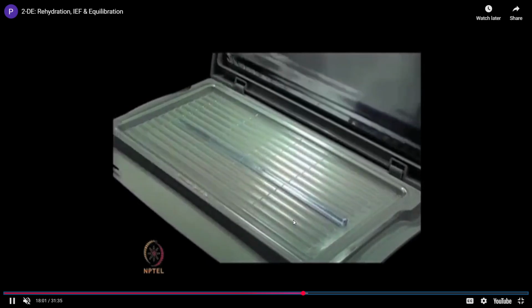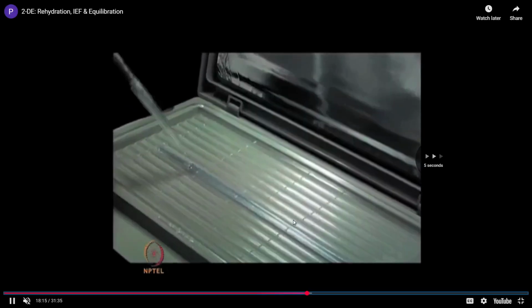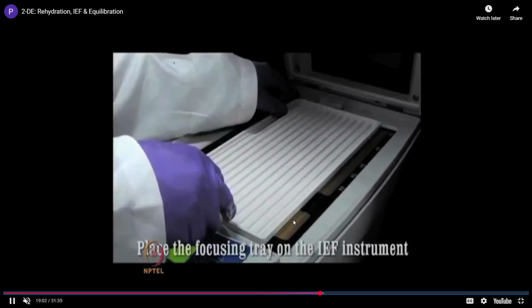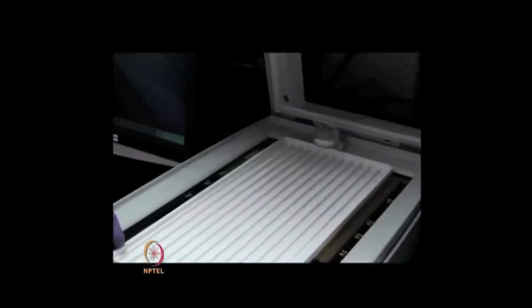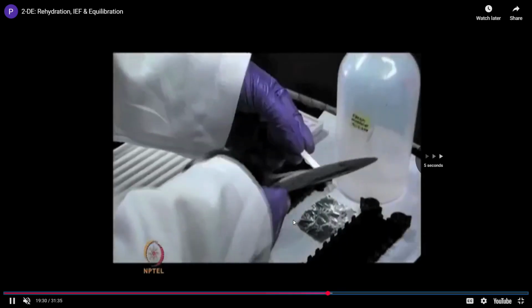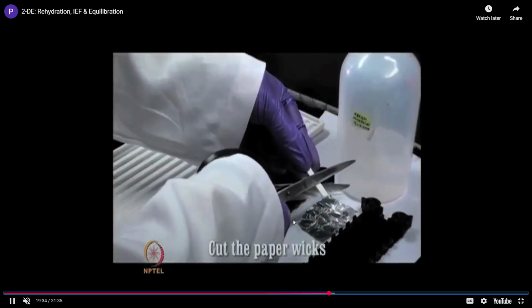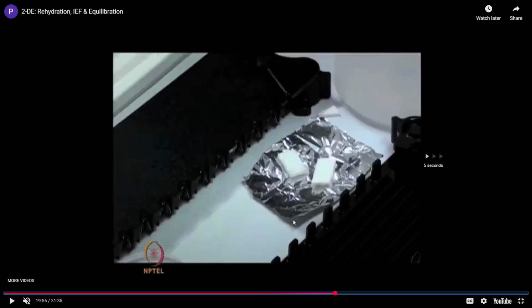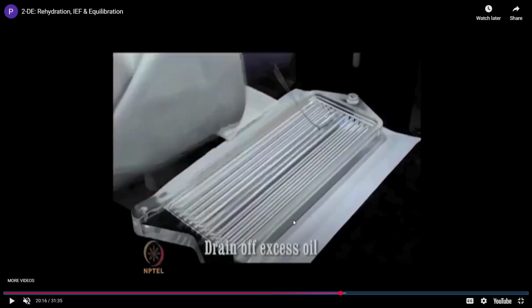Then you will add the mineral oil to it. This is called the focusing tray, where your samples are actually run. You need to use certain paper wicks as well so that once you keep the strip in the focusing tray, it doesn't move here and there and is stable enough. Then you add some water initially for soaking.